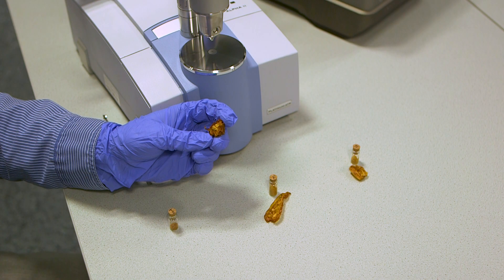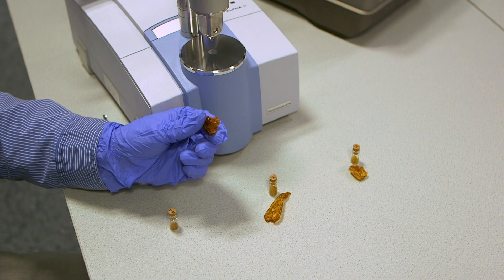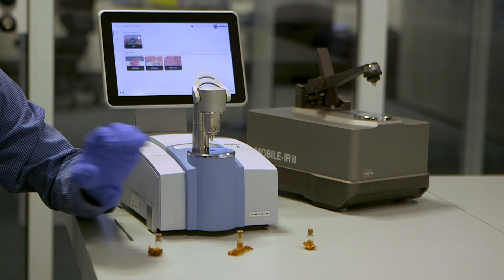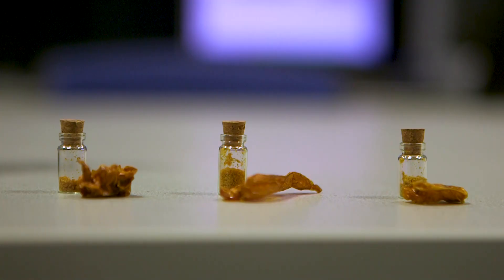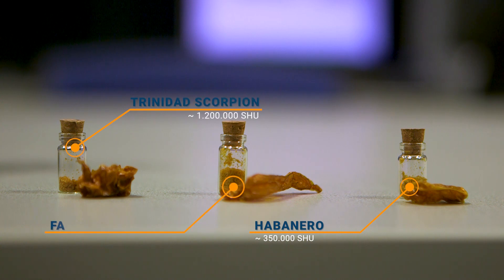In this video, we will analyze dried ground chilis to quantify the capsaicin contained and report it in estimated Scoville heat units. For this we prepared three chilis: a habanero, a trinidad scorpion, and a fatally yellow.